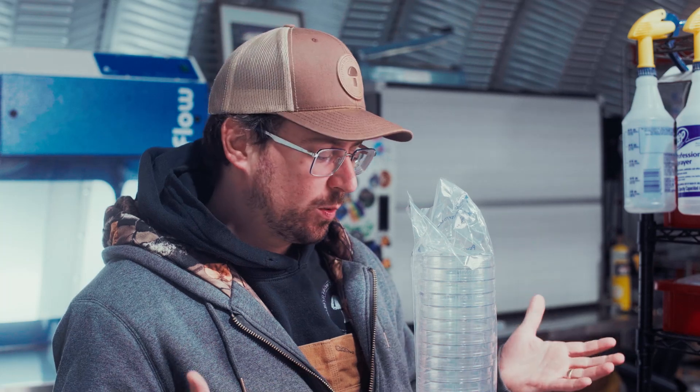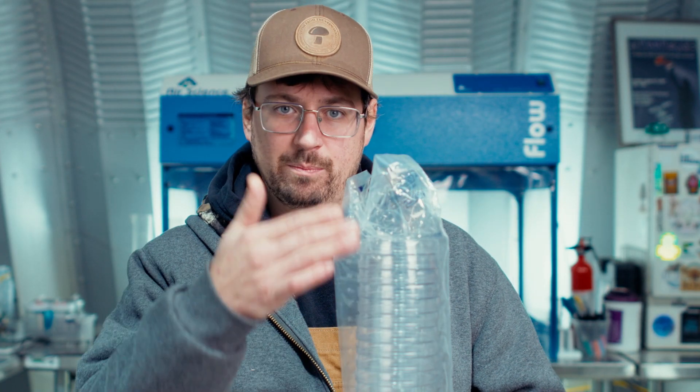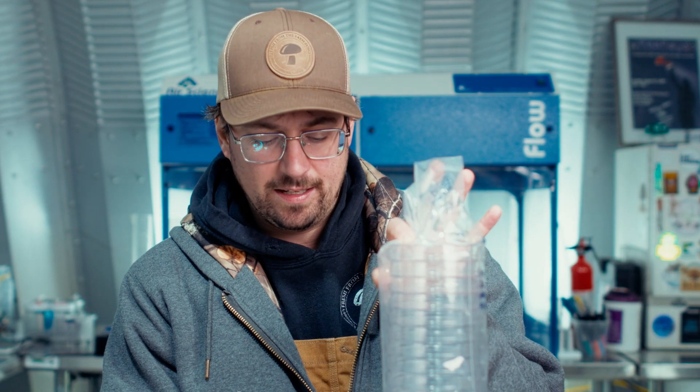The first pro of using a plastic dish over a glass dish is that they're much more efficient. When you purchase a sleeve or a box of pre-sterilized plastic petri dishes, they come in a stack of 20 or 25, and it's very easy to pour all of these plates at once. The plastic dishes all nest in one sleeve, and you can pour them pretty efficiently in one fluid motion — compared to glass, which would be very cumbersome to stack.